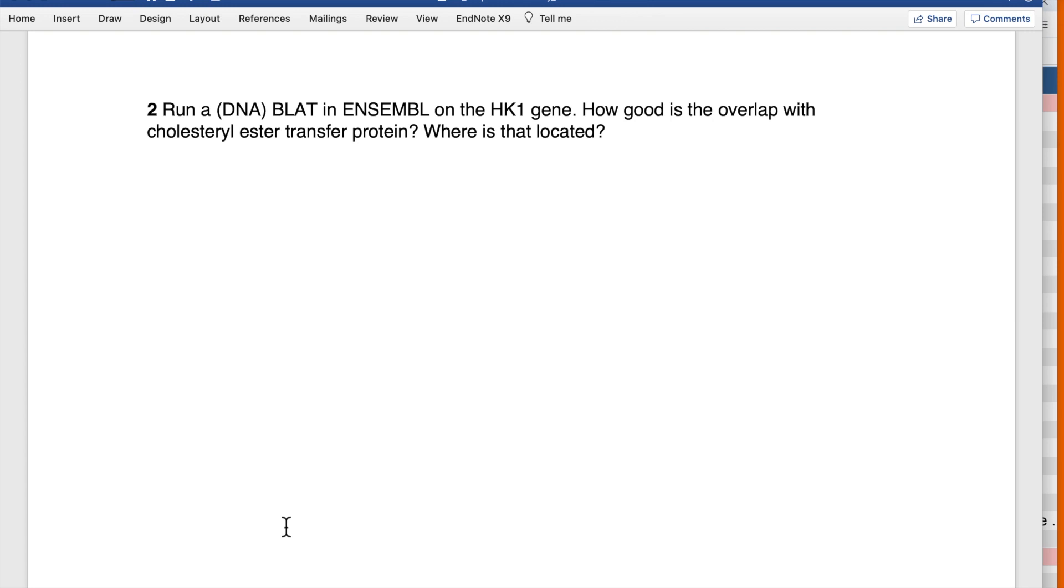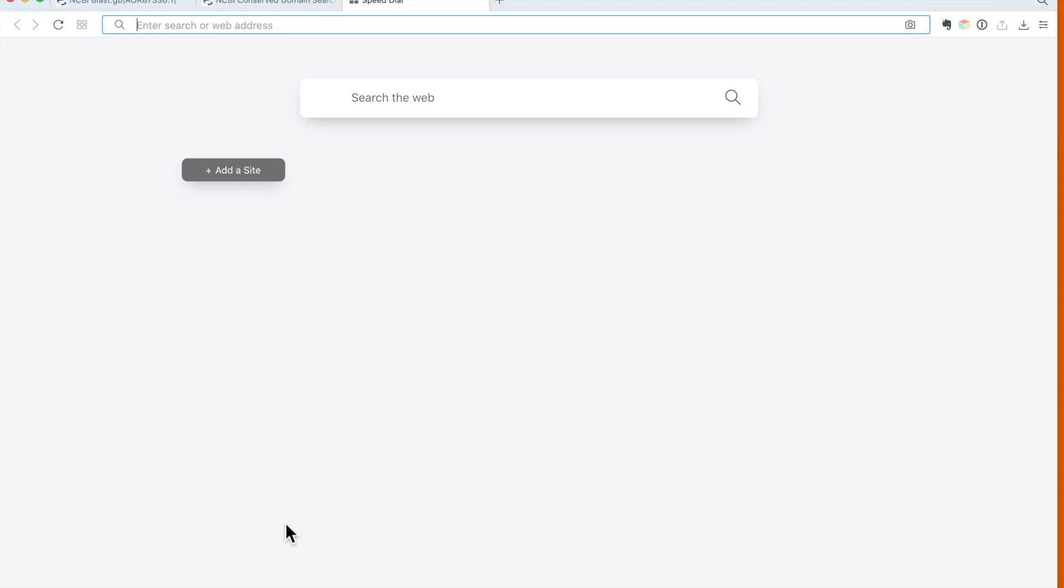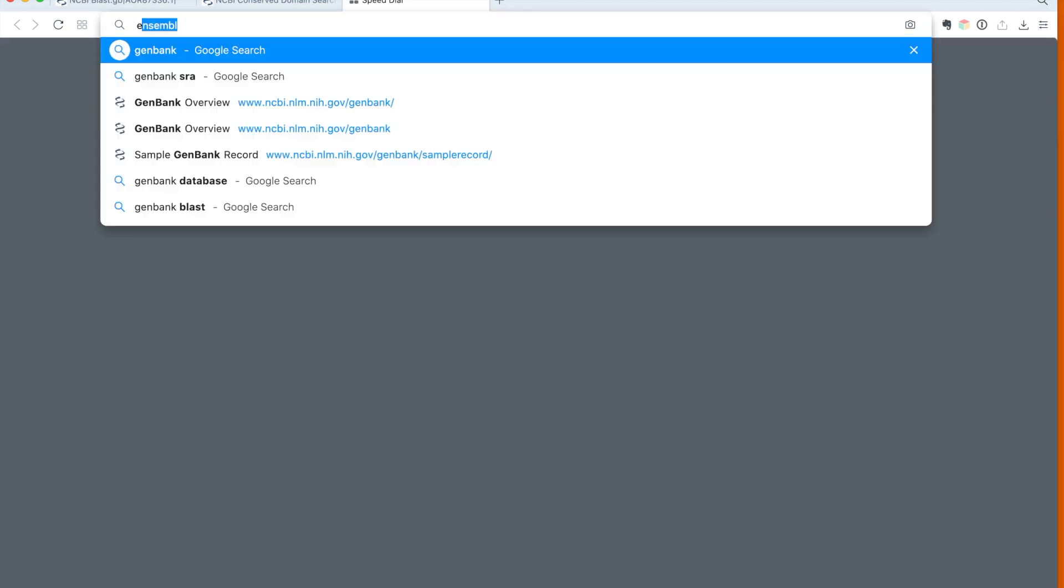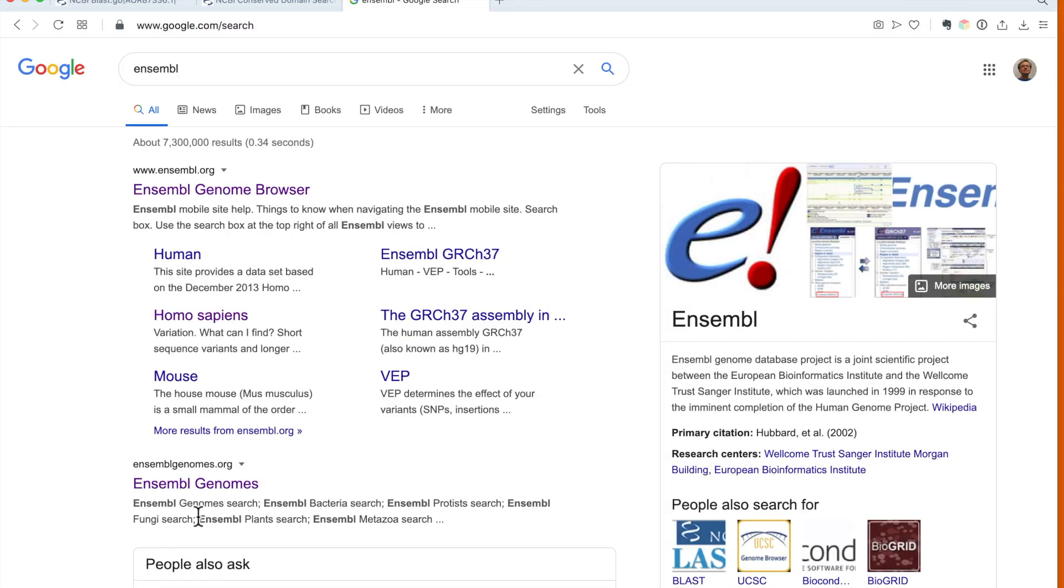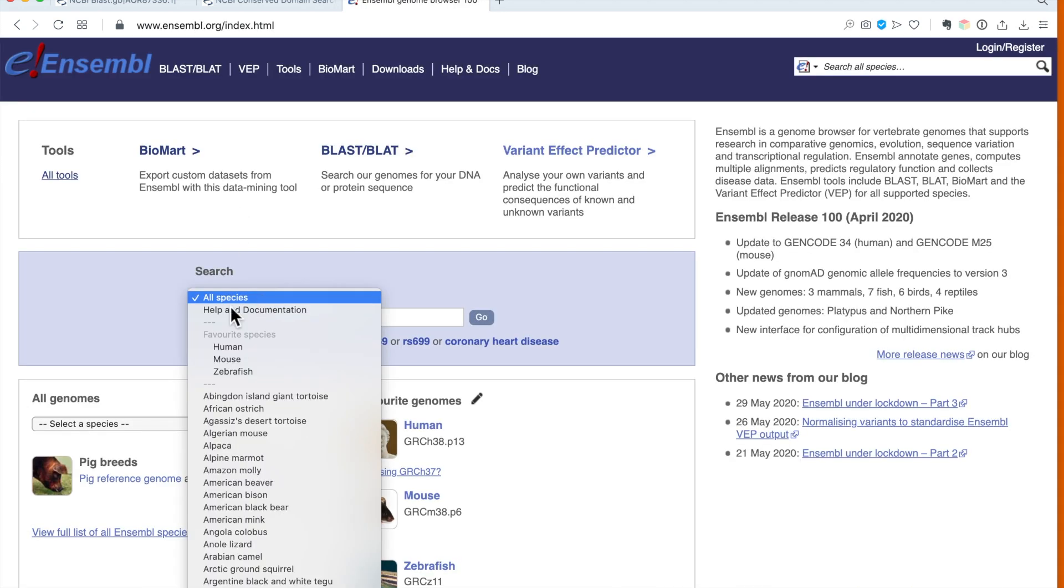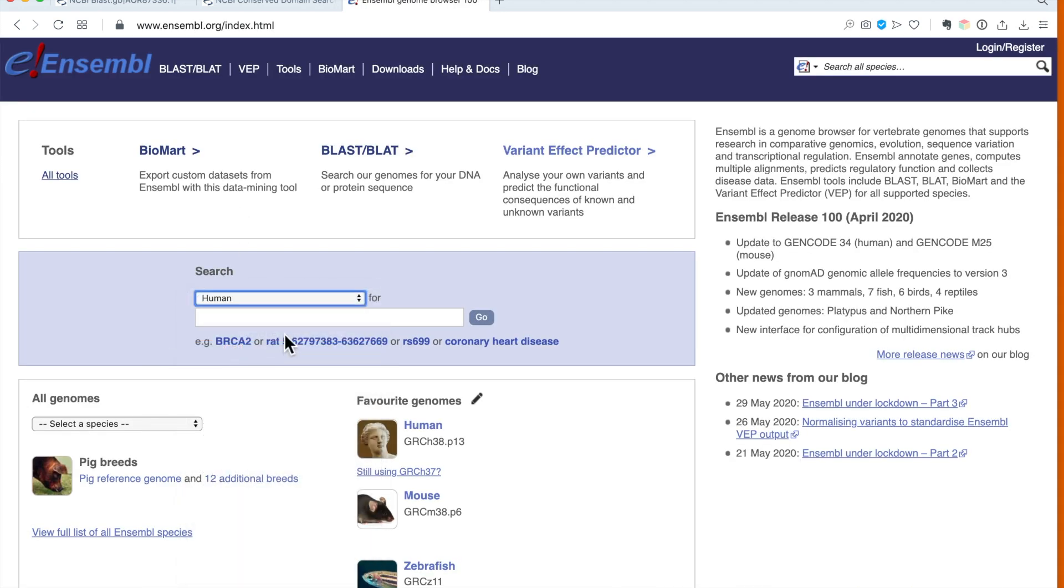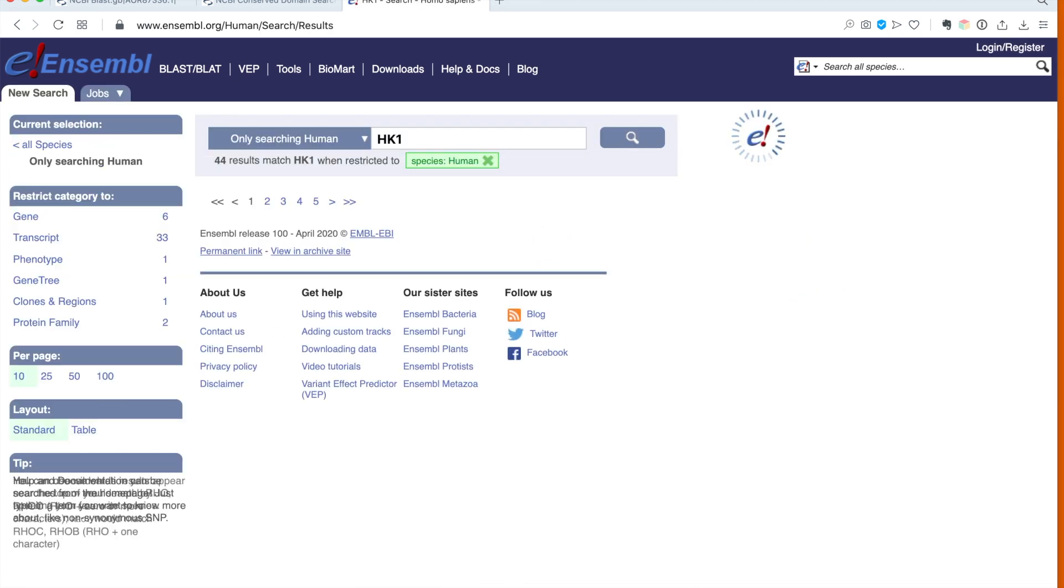Let's try to do that. We open a new window and go to the Ensembl gene browser. If it's human, we select human, and the best is to put the correct gene name in, which is HK1.